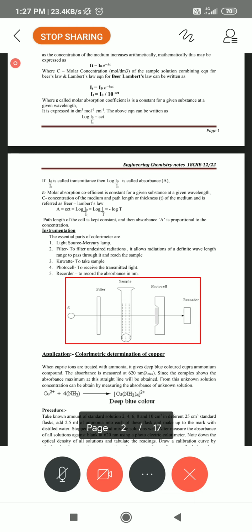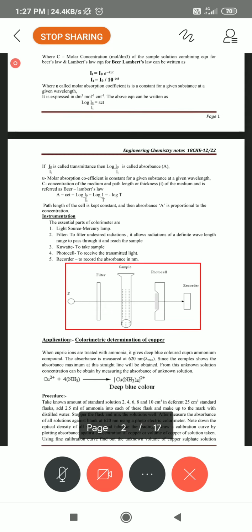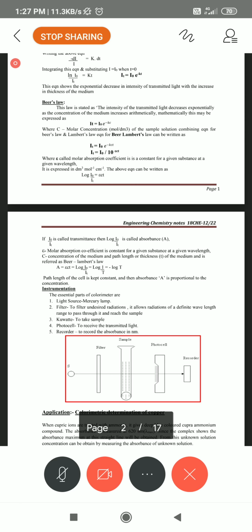You get this calibration curve only by satisfying the Beer-Lambert's law. If you do not get the calibration curve, you have made a mistake somewhere. You will first find out that mistake. Afterwards, you will estimate how much salt is completely dissolved in 1 liter of DM water.